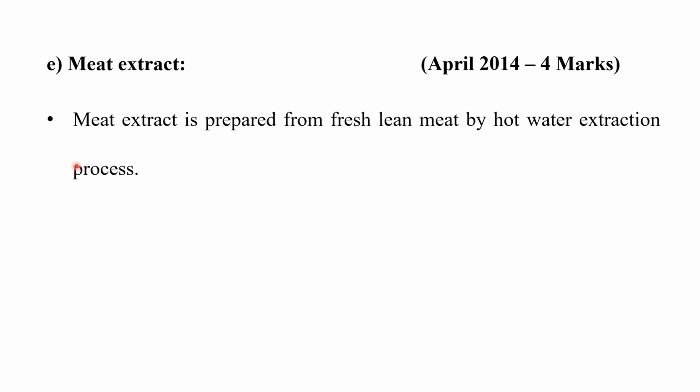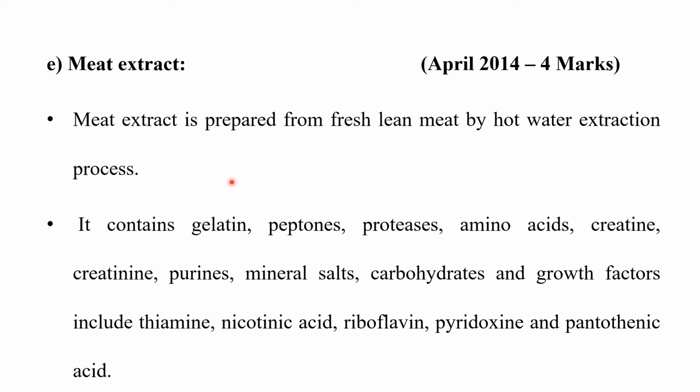Next one is the meat extract. Meat extract is prepared from fresh meat by using a hot water extraction process.